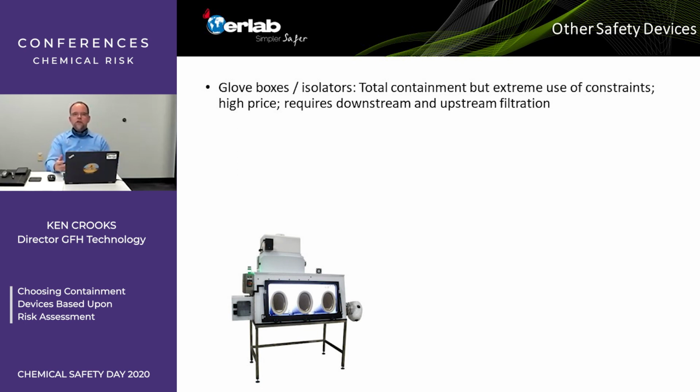It's under negative pressure in case there were ever a leak in one of the gloves. This is a negatively pressurized glove box because the gloves are being sucked in, if you will. If it was positively pressurized because you didn't want to contaminate something, the gloves would be sticking out. There's great pictures of both of those out there. It comes with a very high price. This is maybe not always a custom build, but it's certainly a custom review each and every time to make sure you're getting the right piece of equipment for your needs. And you need that downstream, upstream filtration. Just a lot of cost, a lot of isolation.